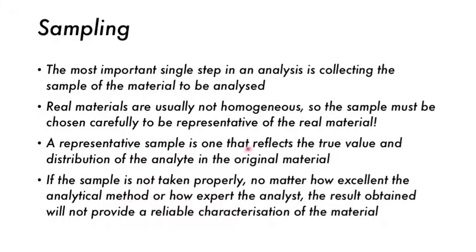So this is usually a bit easier in pure science. Usually we deal with homogeneous samples, which don't have this problem, but oftentimes in industry or in environmental labs, you have heterogeneous samples, which are made up of different phases.